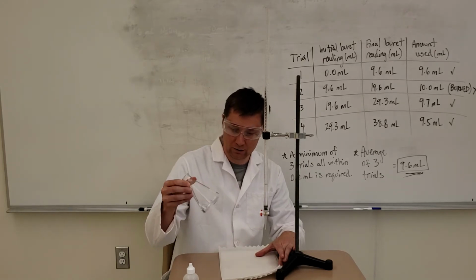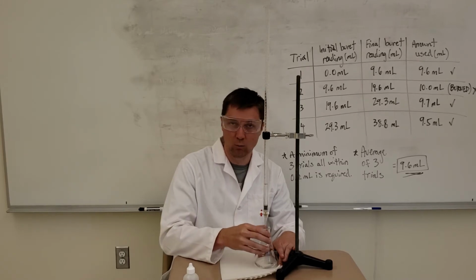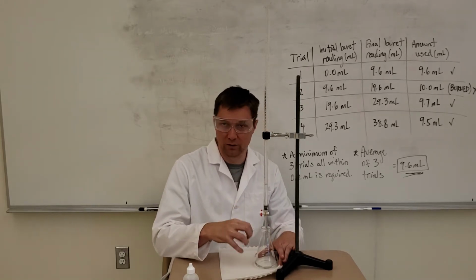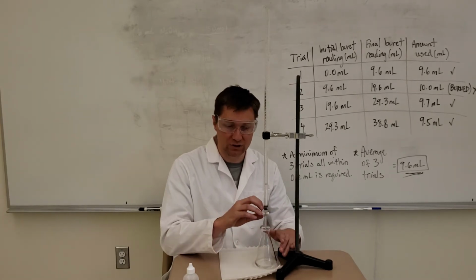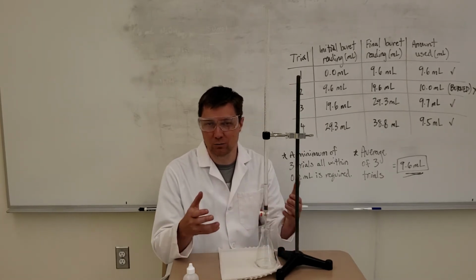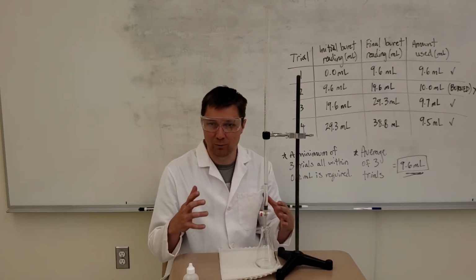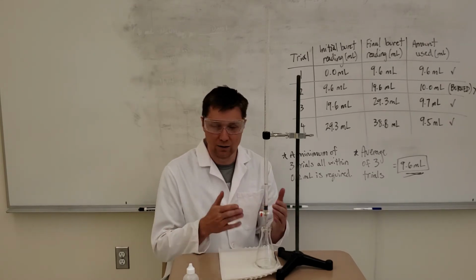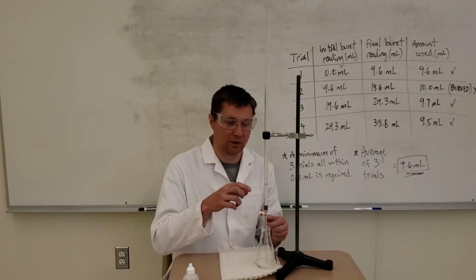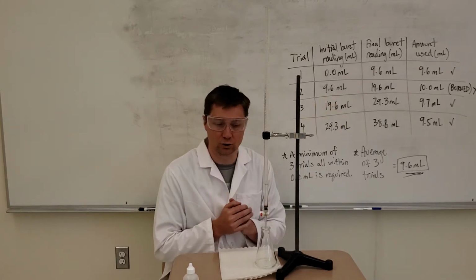So now that's clear again, but I'm probably one more drop away from this being at its end point, and that persistent pink that I'm looking for. The persistent pink is really if I'm mixing, and for about 10 seconds that pink hangs around, and then eventually the solution goes clear again, then that's my end point. I want to stop there and make my final burette reading and record it in my chart over here for trial 1.